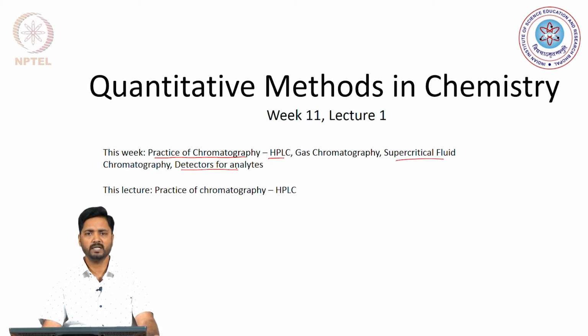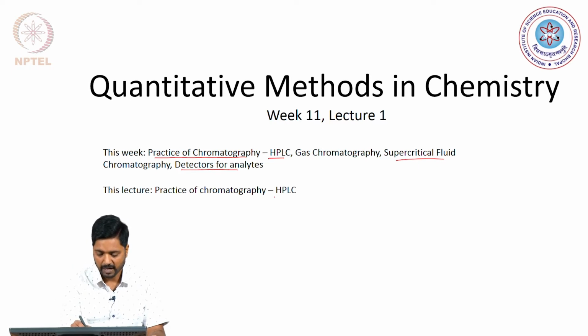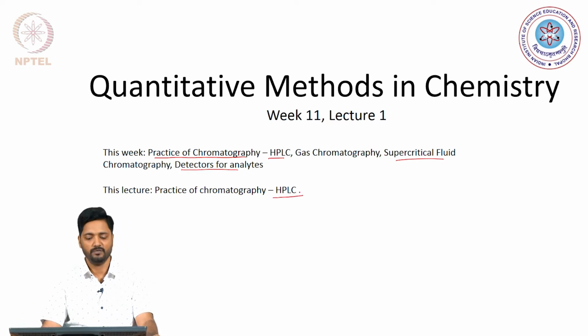So, let us begin lecture 1 by understanding how high performance liquid chromatography works in real practice.